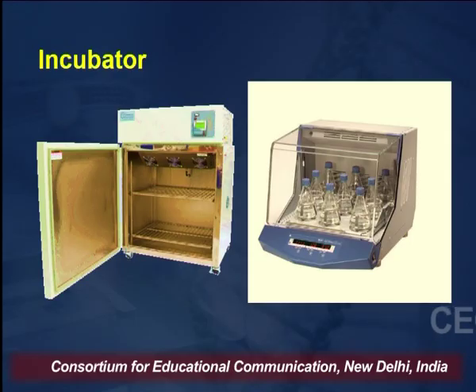All microorganisms have an optimum pH and optimum temperature at which they grow. So, the purpose of the incubator is to provide the optimum temperature for microbial growth along with providing a sterile surface. These incubators are always cleaned and they are sterile. They maintain the temperature and humidity for the proper growth of the microorganism. And the shaking incubator provides the optimum shaking to the media, so that there is continuous mixing of the culture.